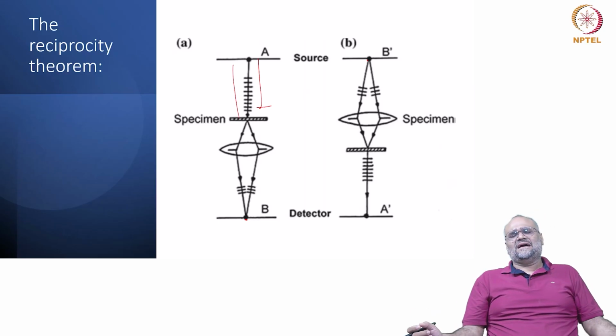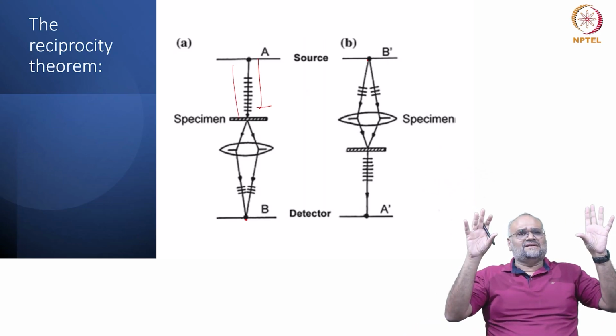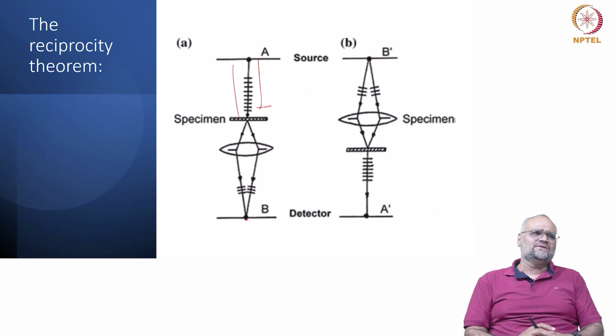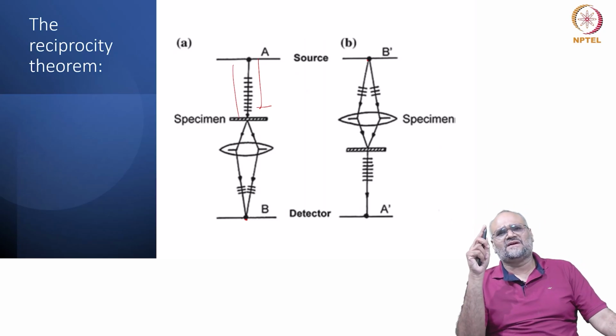So I would effectively, if I integrate the whole thing, assuming there is no absorption and other kind of inelastic effects and largely elastically scattering effects only, the entire electrons should be sort of conserved.